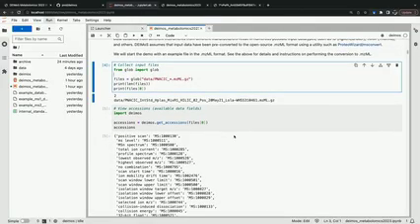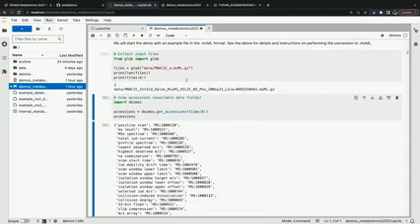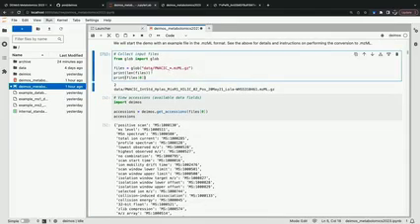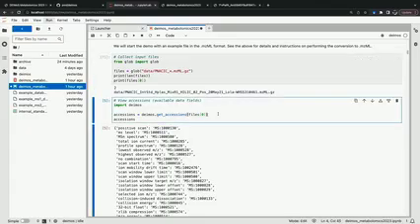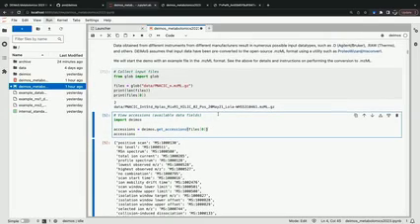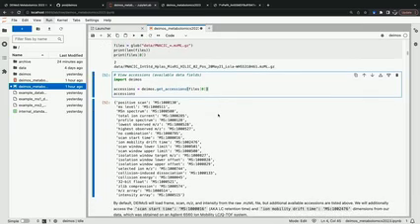And so if you download directly from Zenodo, the data will come included in this data folder. And here I'm just pulling the data files that we have using Python globbing, just grabbing all of the data files here. Here we have 2 included, and I'm printing an example file name from one of them. So this actually came off of one of our instruments at the laboratory. And I can use DEIMoS to look at your mzML file.